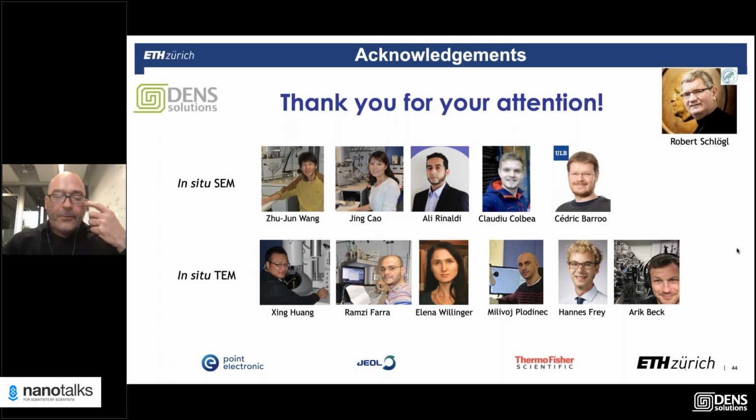Yeah, so as a human with only 2 hands, you're quite limited when you do in situ experiments, especially at the beginning. We had to get up sometimes to change our gas valve somewhere on our gas panel, and then you have to control the microscope, and you get so excited. But then someone should actually make notes about what the conditions are now, which temperature. So basically we had to be 2 or 3 people at the microscope at each moment. But now we have this nice software integration.